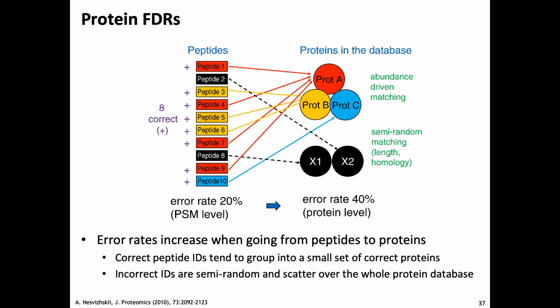And there are a few ways to do that. You might have seen that here and there. In the same way that you can control for FDR on the PSM level, you can also do that on the protein level. And that leads to different thresholds. People tend not to like it because they lose so many proteins. But you should keep in mind that you're losing the incorrect identifications primarily. And you get a much more accurate estimate of what you really had in your sample.